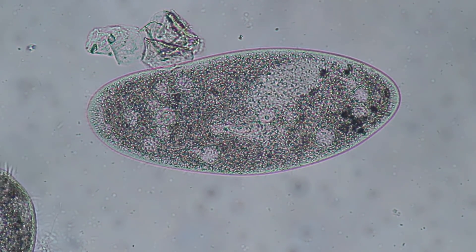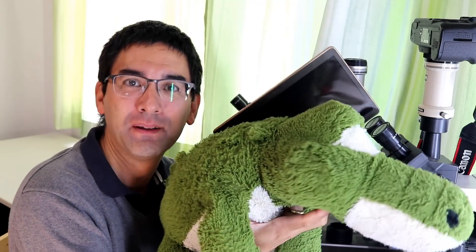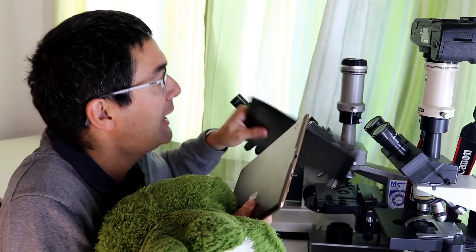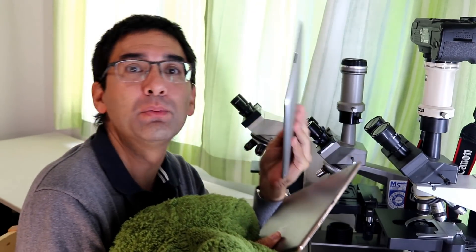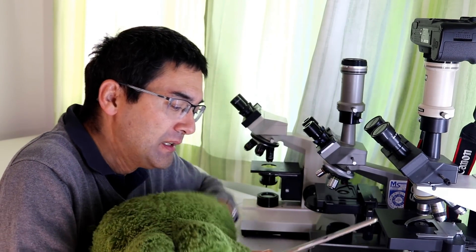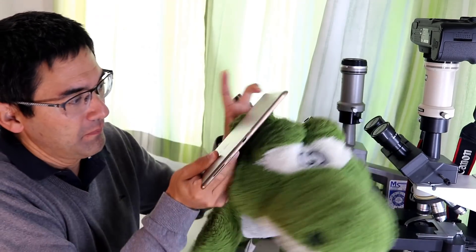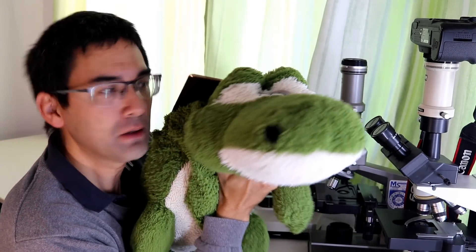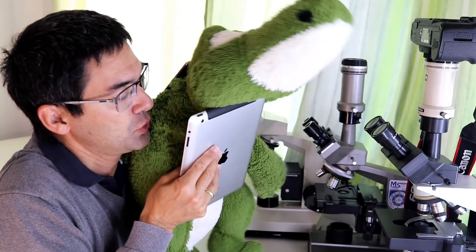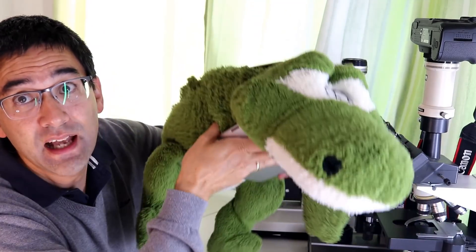And imagine that this here is not a Samsung Galaxy, but the cover glass. And here I have an Apple iPad, and this one should be our microscope slide. And basically what happens is the following: this little Paramecium is now squeezed between the cover glass and the microscope slide like this. It's kind of sandwiched.